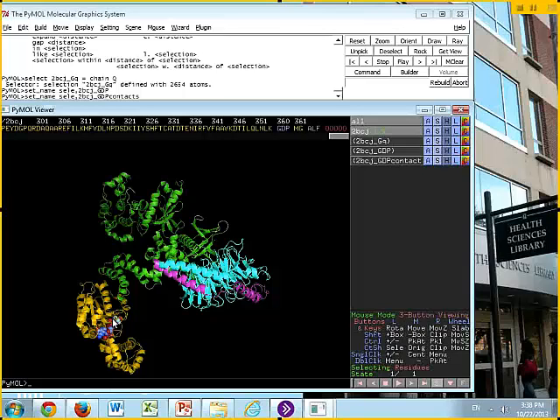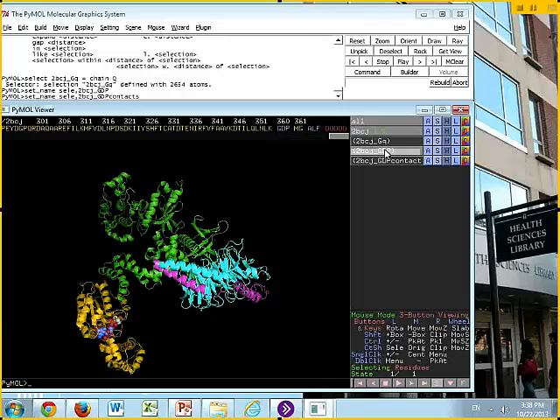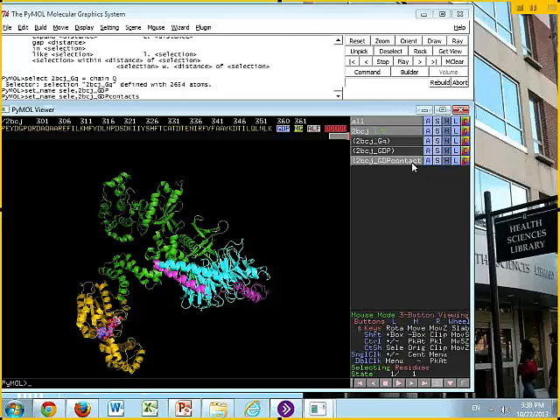This is our ligand. One of the things that we're frequently interested in are which residues, which amino acid residues are contacting that ligand. So we can ask that question in PyMOL. 2BCJ underscore GDP is just our ligand. We're going to come down here to the contact one. Now right now that's identical, but we're going to modify that selection.